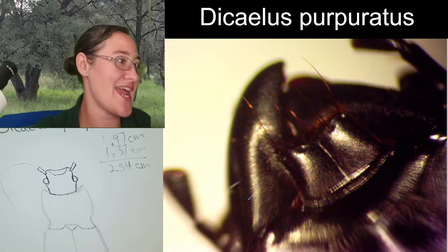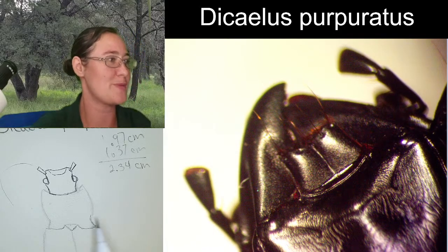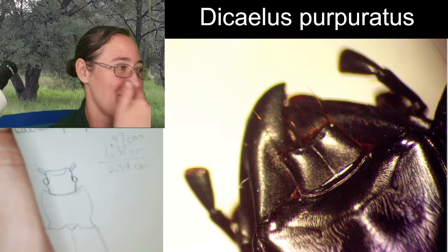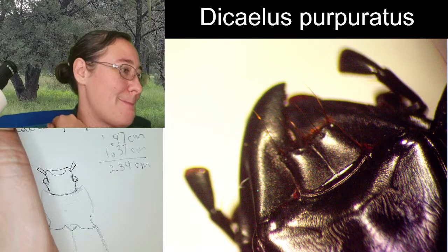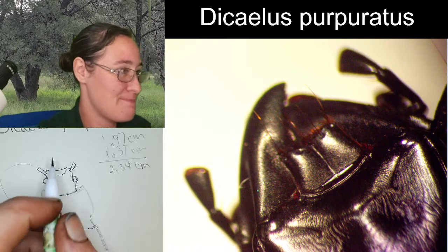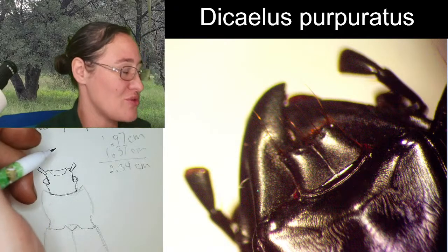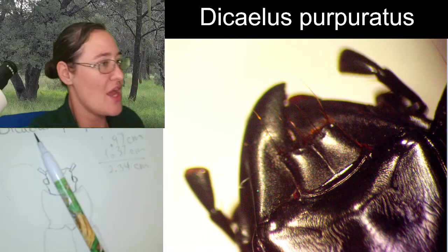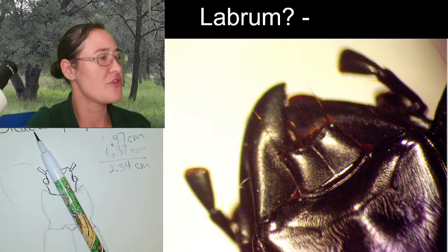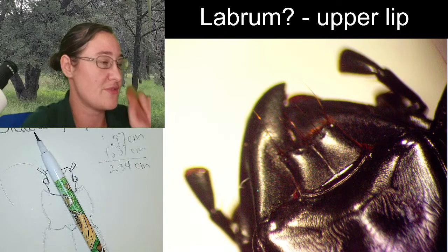I was gonna take a ponder, take a guess as to why these are called the notch-mouthed ground beetles. I would say it's because of that notch in the labrum. I want to call this the labrum. It's just a very odd-shaped one. Normally, they aren't so large. Normally, they aren't so pronounced. The labrum is the upper lip. Generally, it's the top piece of the mouth.